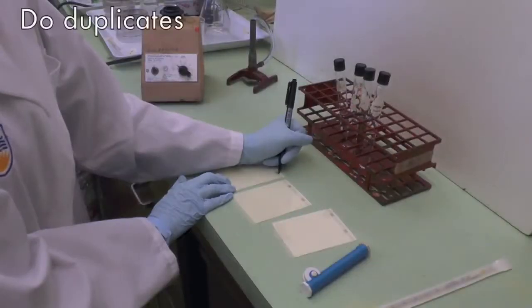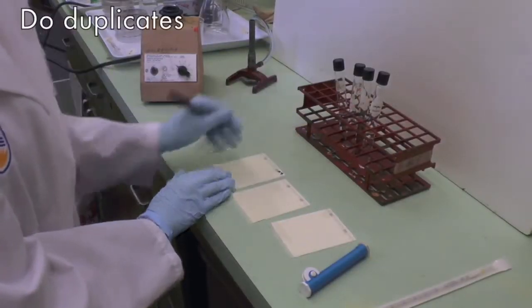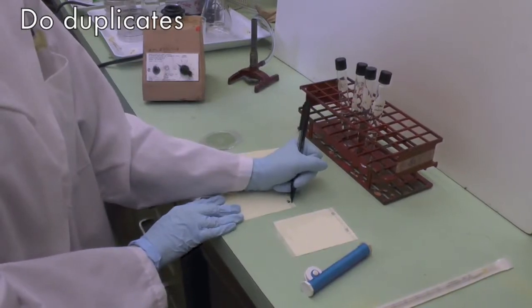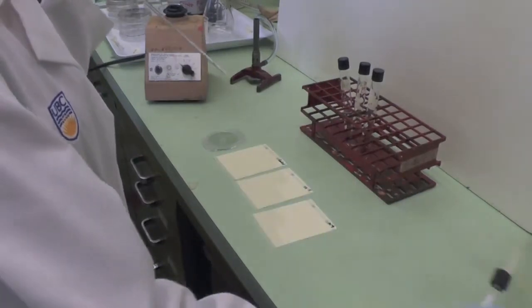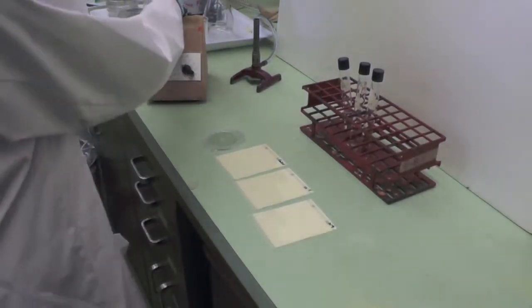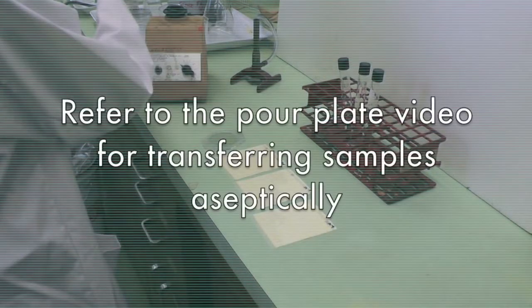Label the petri film with the sample dilution and peptone control you will use in duplicates. Always start with the peptone control, then work your way from the most diluted sample to the least diluted so you can use the same pipette.